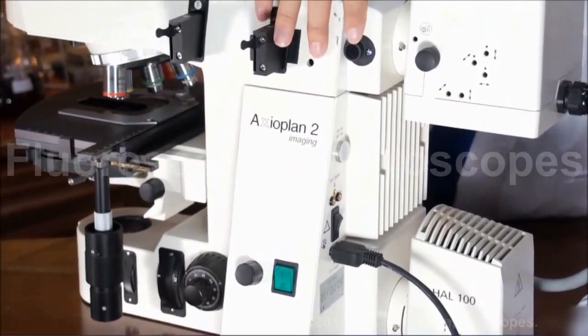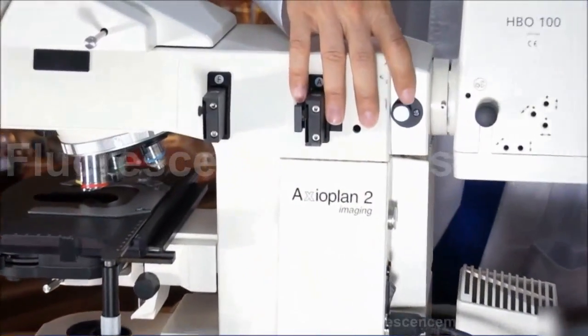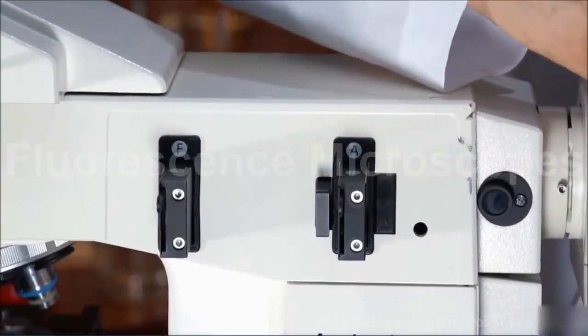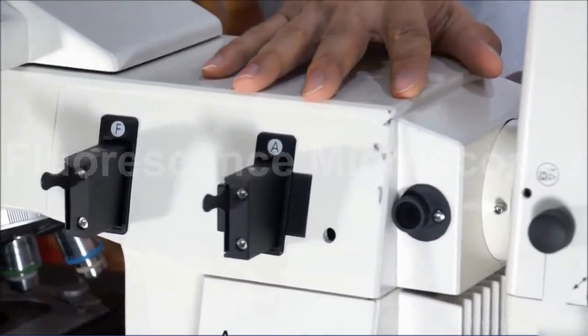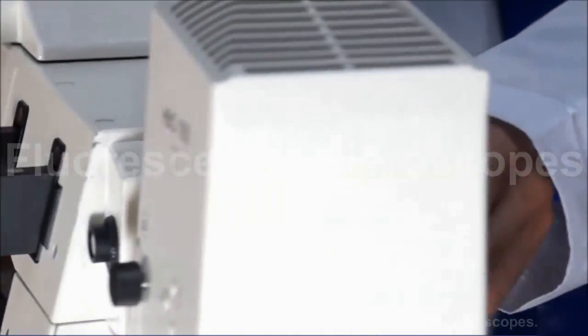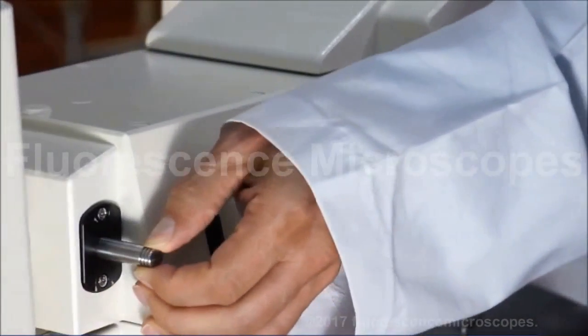This is a viewing aid. You're going to look into this port to center your mercury bulb. And there's a button or a pull lever on this other side that you're going to pull out.